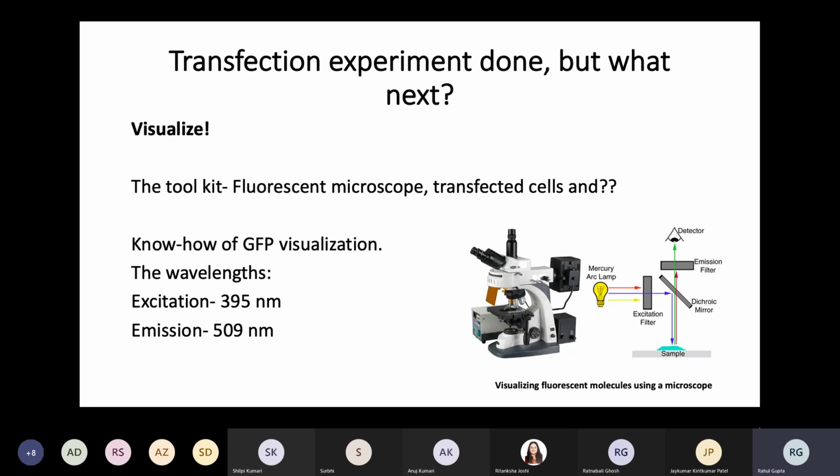Say you want to have a transfection, and you're doing your fluorescent imaging maybe two days after the transfection is done. You can have a look at how the transfection has progressed over a period of days. And since it's a transient transfection that we have been discussing, you'll also get to see that after a certain number of days, the signal would essentially fade.